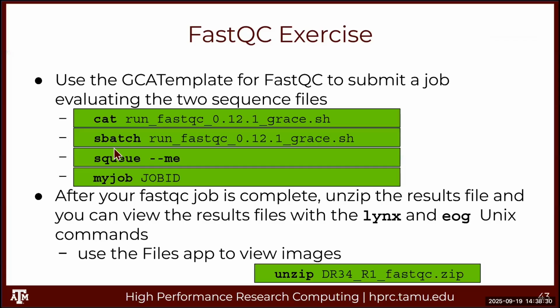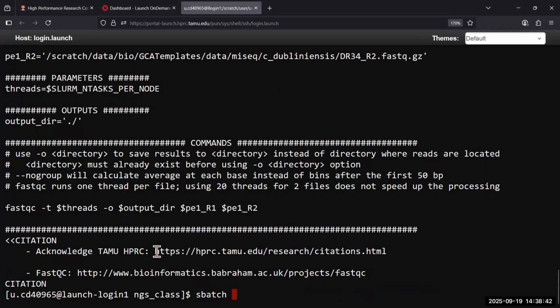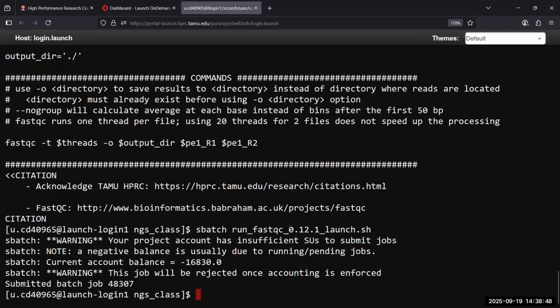All right. Now we're going to submit this file. To submit the file to the Slurm scheduler, you type in SBatch space and type in RU and hit tab. Okay, SBatch run. Now it says, I don't know if you'll see something like this.